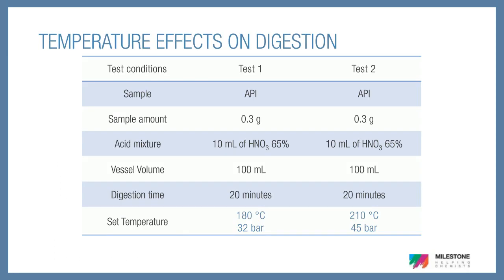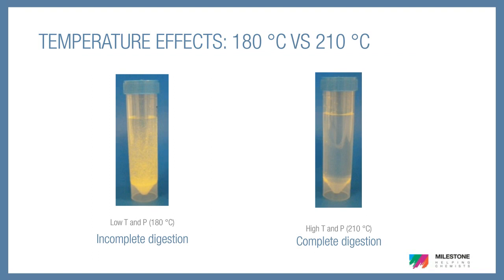It's important to understand that temperature is a factor that drives digestion quality, and pressure is just a byproduct. To illustrate the importance of temperature on digestion, we digested two API samples, keeping all variables the same, except temperature. In test one, we digested at 180°C, and in test two, 30 degrees hotter, at 210°C. If we look at both samples, you will see that the one on the left, digested at 180°C, is yellow, and the one on the right, digested at 210°C, is clear. The yellow color is indicative of residual carbon content, which is essentially undigested organic material. This can cause many issues on your analytical instrument, such as carbon buildup on the interface cone or polyatomic interferences. Just by going 30 degrees hotter, we have a clear solution, commonly referred to as visual clarity, which is the target of any digestion.